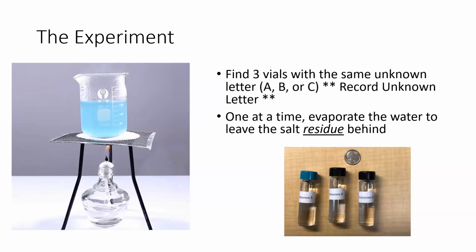The picture has quite a bit of volume. You can see it's about 170 milliliters or so. There's definitely not going to be 170 milliliters in each of your vials, so we're going to have a much smaller amount of liquid in the beaker. Don't be concerned about that. In addition, our solutions are colorless, so we're not expecting a blue color at all.